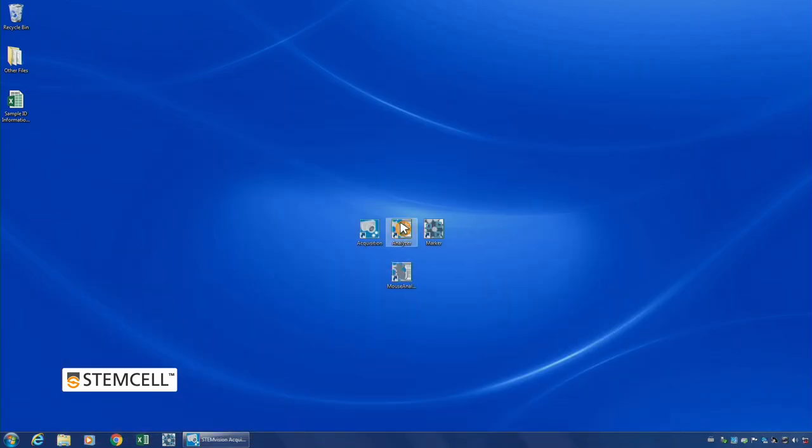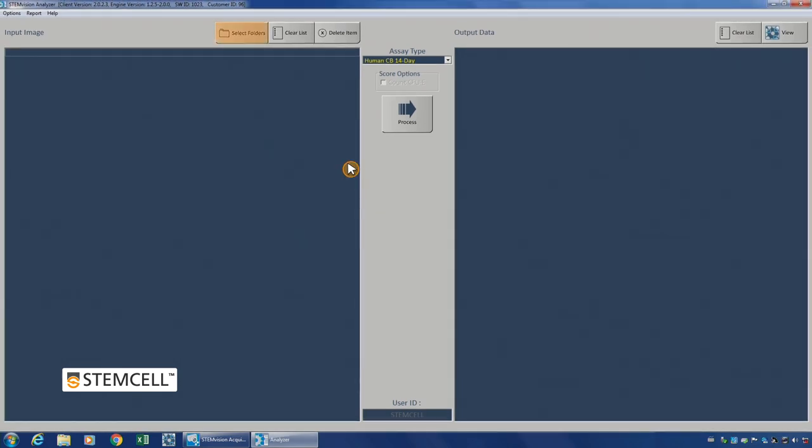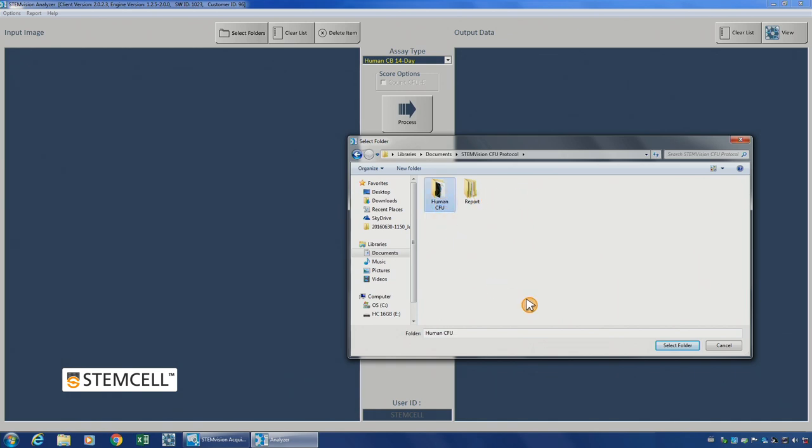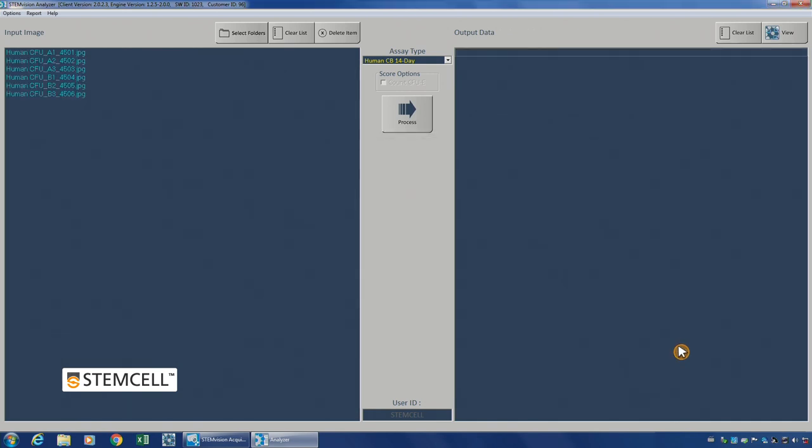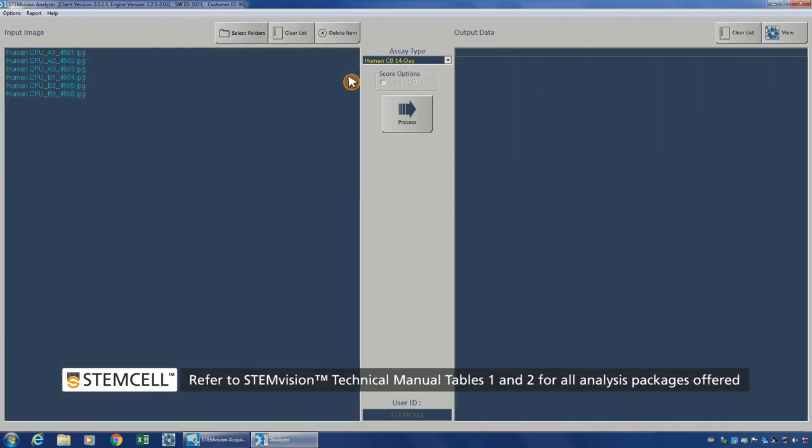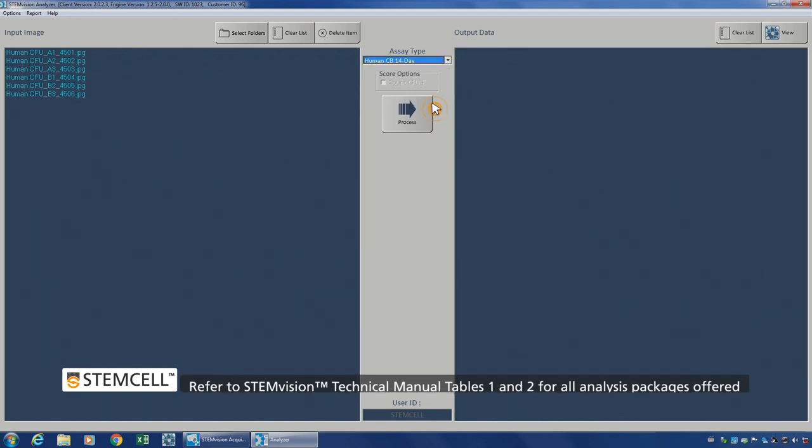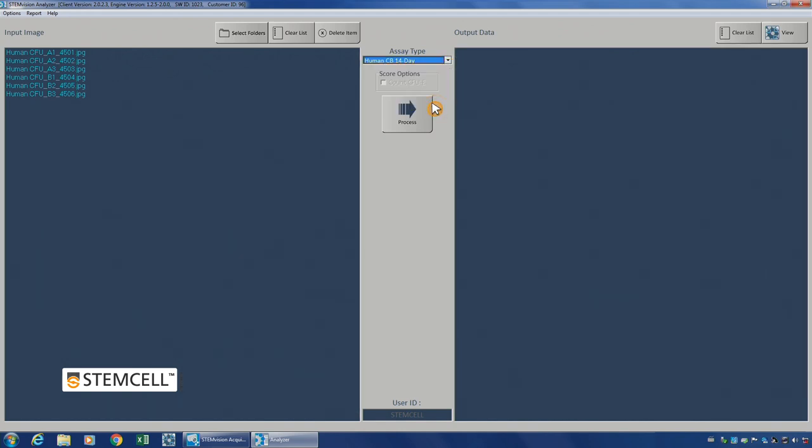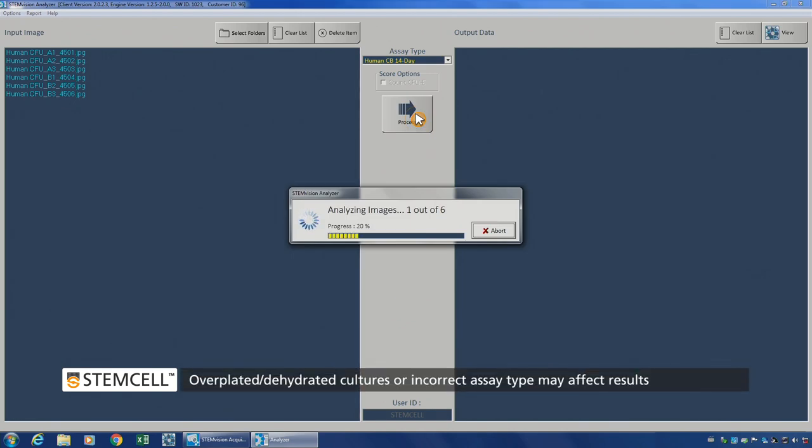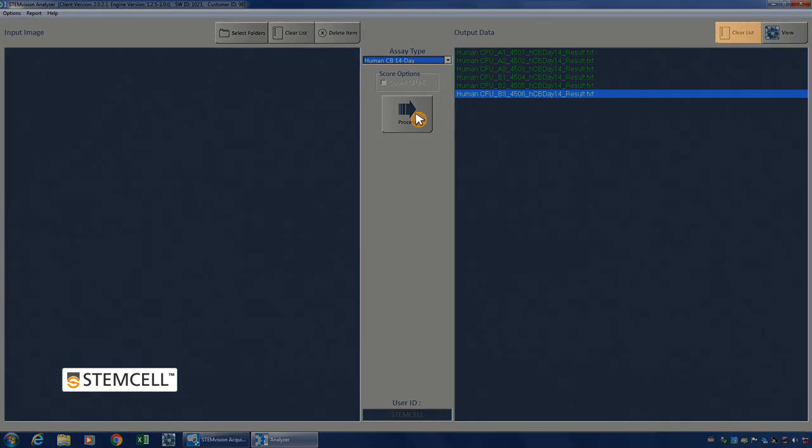In the Analyzer application, click Select Folders and choose the location of the images to be analyzed. Multiple folders may be selected at once. All selected STEM Vision acquired images will appear under the Input Image field. After selecting your images, select the appropriate assay type and relevant conditions. Click Process to start the analysis. Once done, click Clear List to clear the analyzed images if you wish.